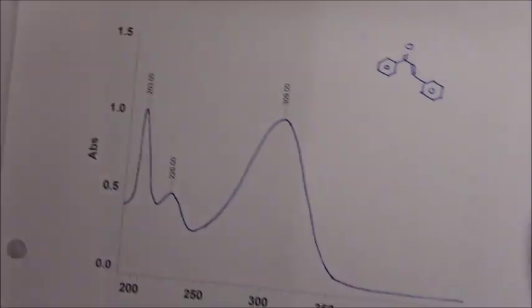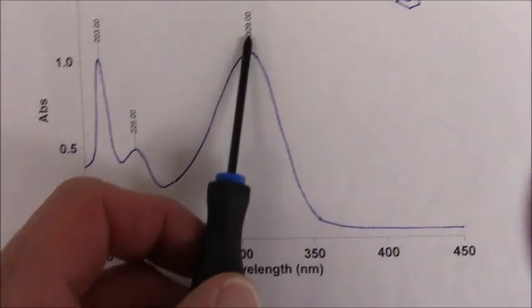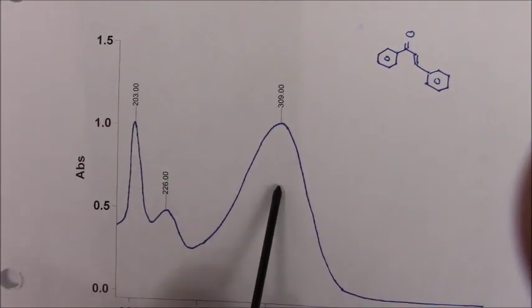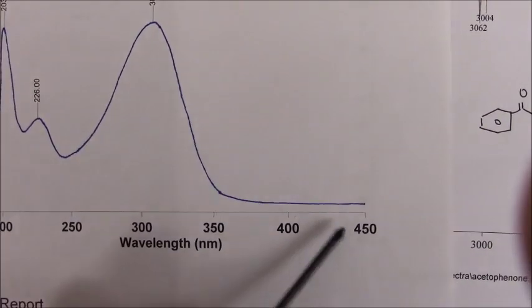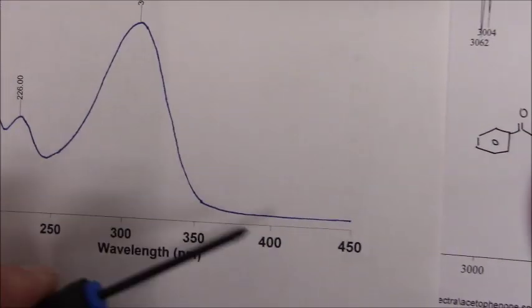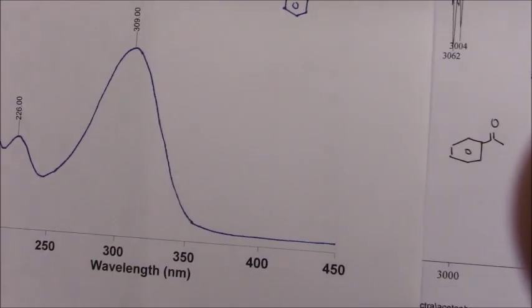The final product, though, and we already know, we'll discuss this after, its strong absorption is actually at 309, and you can see it tailing down near 350. If I was to run this much more concentrated, so if these peaks were maxed out up here, you would notice you would still have a small blip right at 400, tails into it, but you have to run it super concentrated. So all that means is there is absorptions happening right around in here, but a low extinction coefficient. But that's exactly what will give it its yellow color, so we'll get to that.